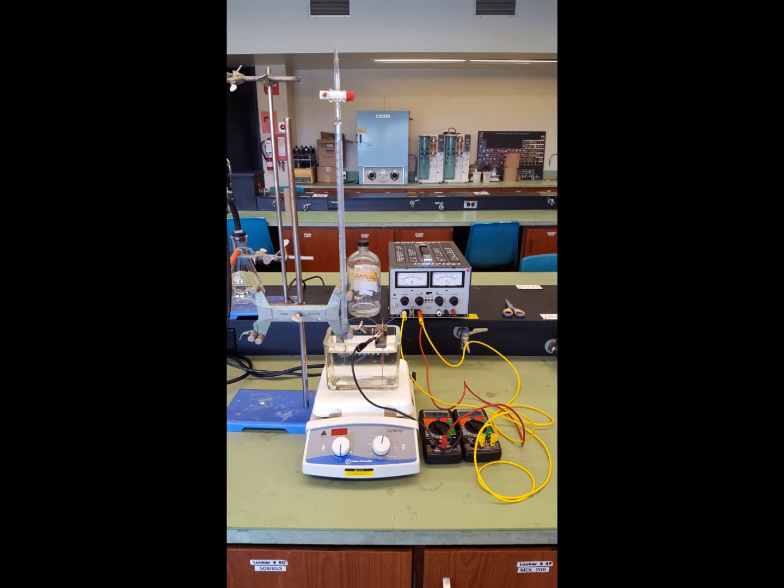Now, to get the acid in the burette, we have a 25 ml burette that's mounted upside down. And get the instructor's help here, but attach a vacuum hose to the top end of that burette, the high end, and open the stopcock, and the vacuum will allow the sulfuric acid to raise, do this carefully, raise up to the 25 ml mark, and then shut the stopcock off.